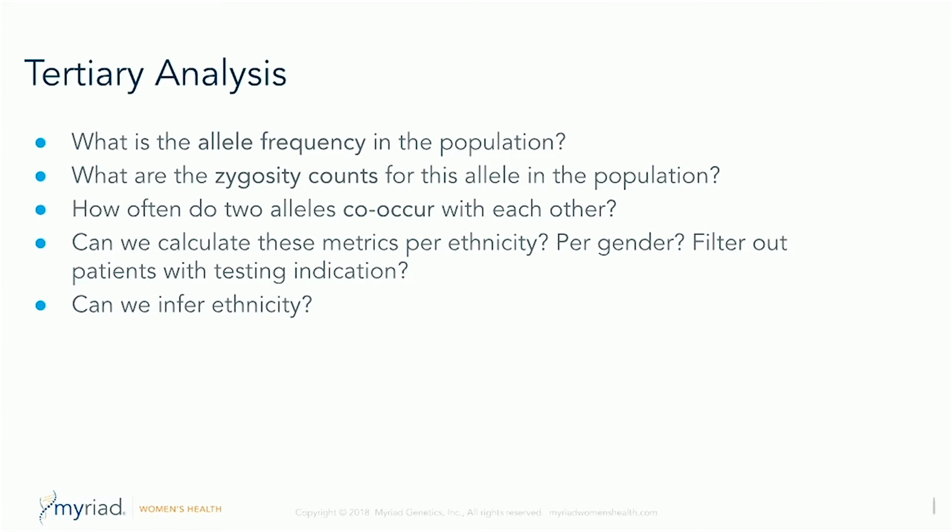Finally, tertiary analysis does not need to be limited to variant interpretation. We may, for example, want to infer ethnicity of patients based on their genetic information, and this falls under the realm of tertiary analysis.